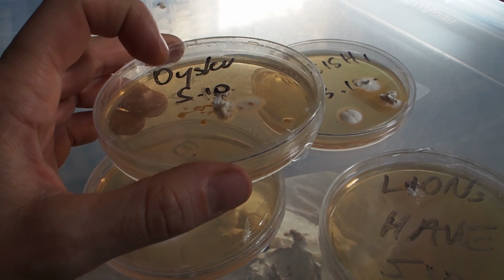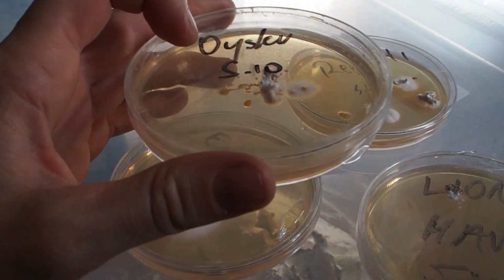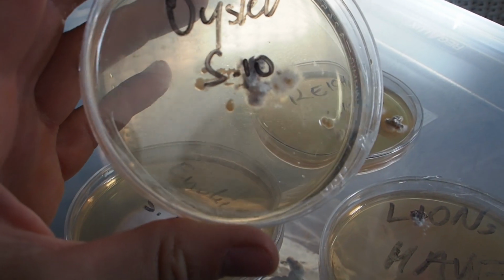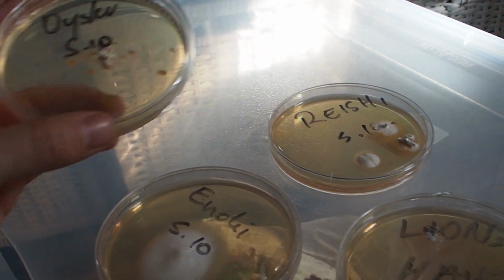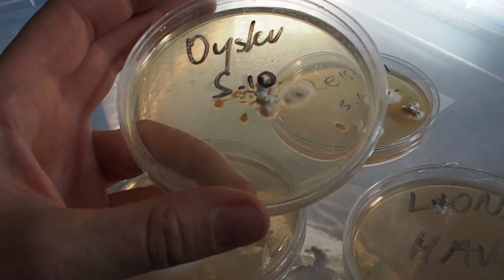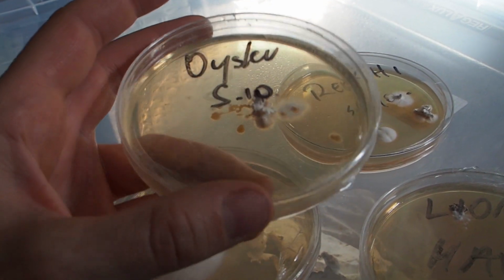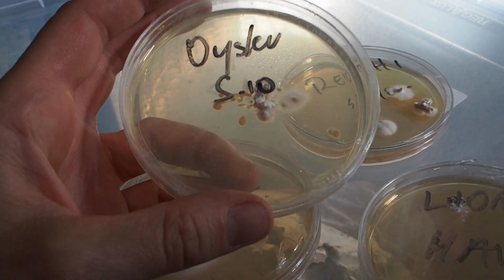Yeah, and also I think that the oyster jar is contaminated too. It seems as if there's some kind of slime mold in the jar, which is getting bigger. So I have to trash this one because it's really close to the culture. But it doesn't matter because I will soon have some oyster mushrooms in the basement, and then I can take a new culture from those mushrooms.